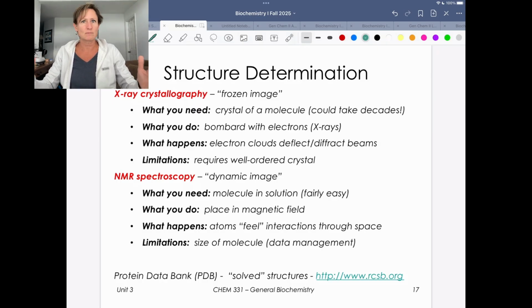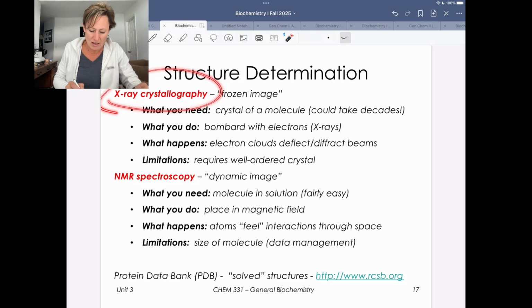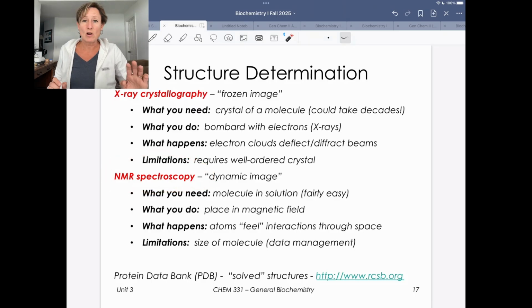How did they figure out 75 years ago that nature had it right millions of years ago to make the opposite handedness of fibrous proteins like collagen and keratin? Well, currently there are two main methods to determine protein structures. There's X-ray crystallography and then NMR spectroscopy. In lecture here, we're going to keep it fairly simple to understanding these two.